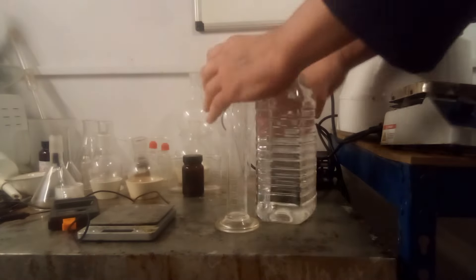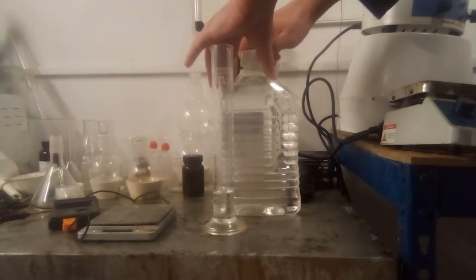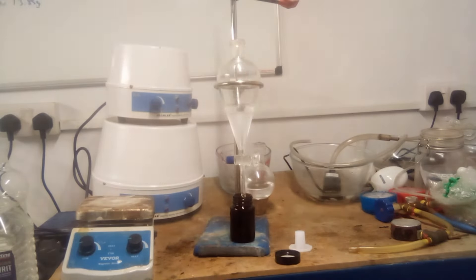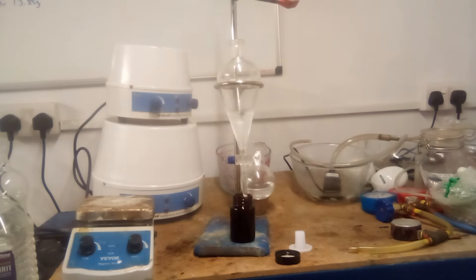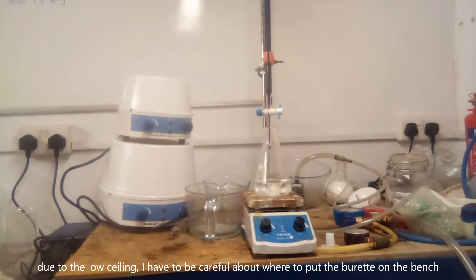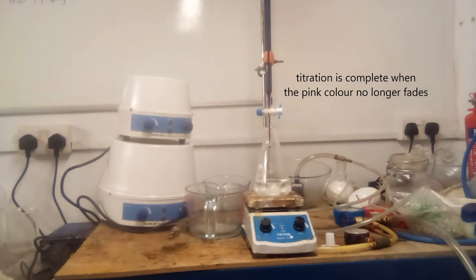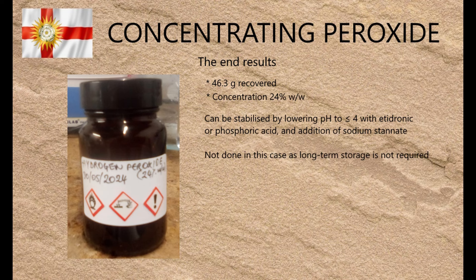To remove any remaining xylene, the distillation product was washed with 20 ml of low-odour white spirit and the two phases were separated using a separating funnel. The amount recovered was 46.3 grams. To work out the concentration of peroxide, a sample was dissolved in 7.5% sulfuric acid and titrated with potassium permanganate solution. The peroxide content was 24% by weight, which is about what you'd expect when a little over half the water is removed from a 12% solution.